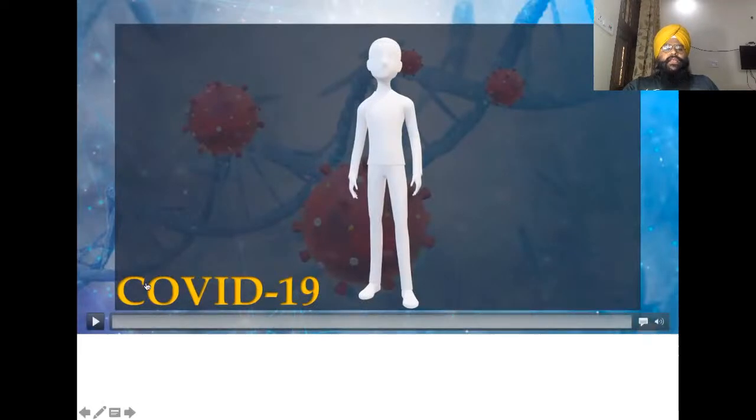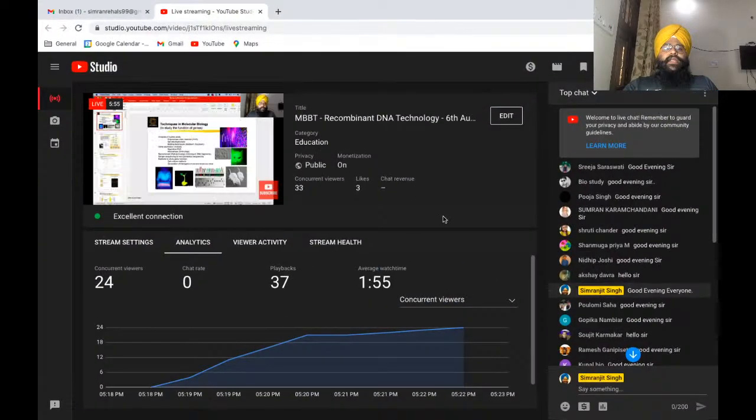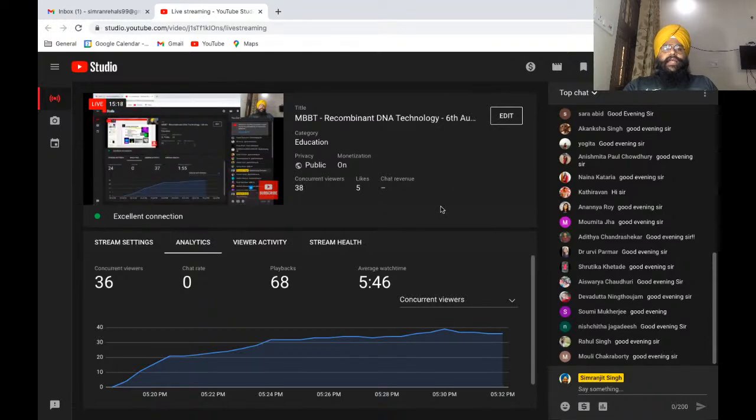Now let's see the COVID-19 RT-PCR that we see normally in our day-to-day life, right? I think most of you have had this COVID test in your life. So we will check that one now.